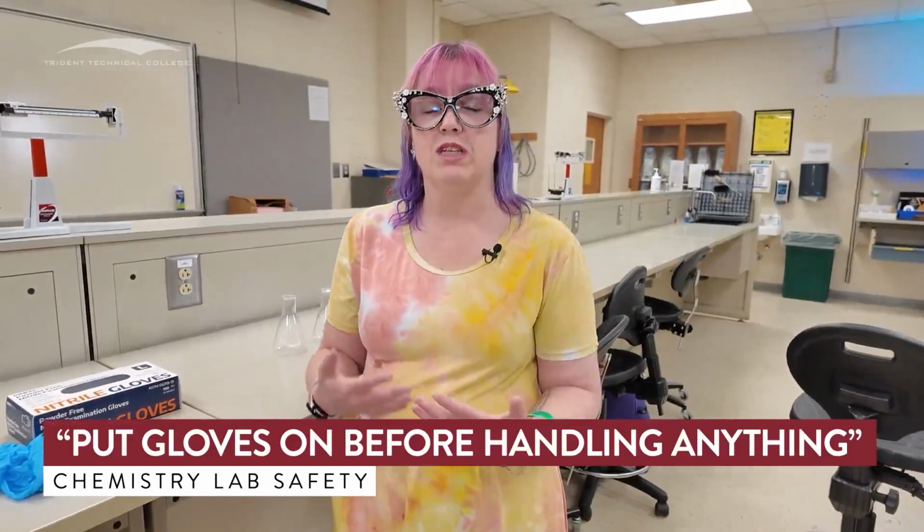So we want to make sure that we're dealing with everything in gloves. Anything that we deal with in the lab needs to be done that way. Anytime anybody is working with anything, doesn't matter if it's chemical or not, for those labs, we need to be wearing those gloves, okay? So I think that's everything I need to talk about with the gloves.